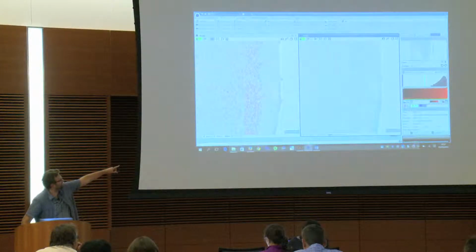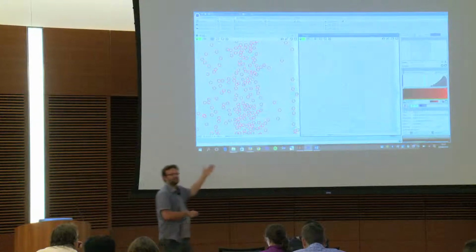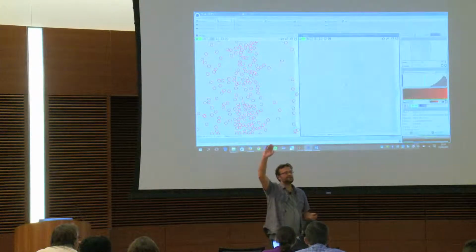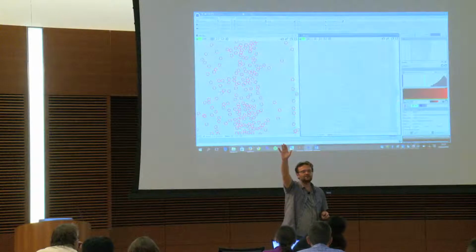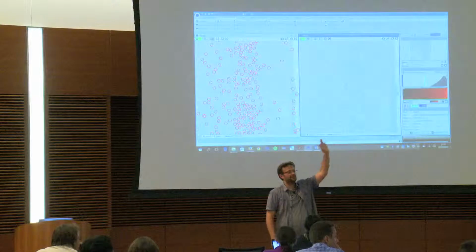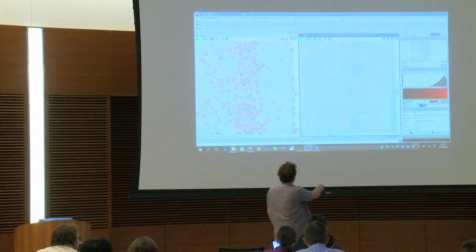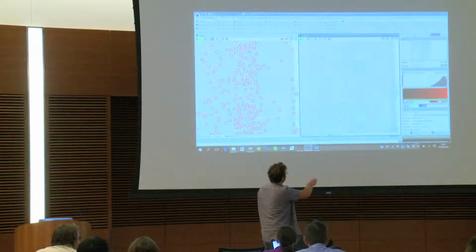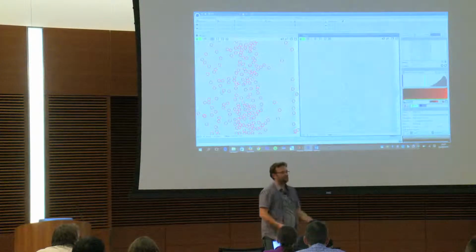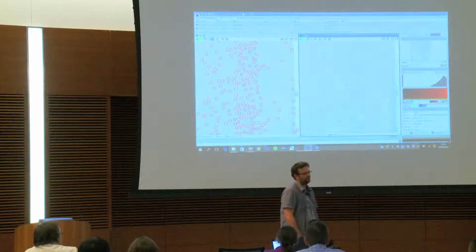Okay, so sorry. So I have a better close-up to see if it fits the detection. So do you believe it's okay or not? Okay, I will ask again like that. So you say yes, it's okay? 1, 2, 3, okay. And some people say it's not okay? My question is, I have all those neurons here, and I'm detecting them automatically. So I'm just asking you if you would be confident in the result I'm providing.